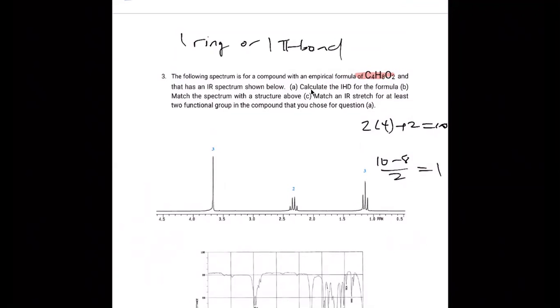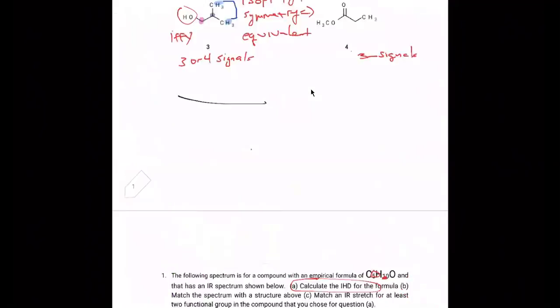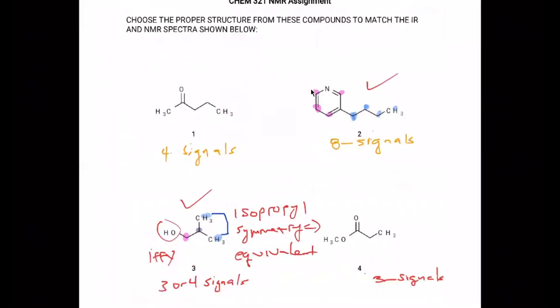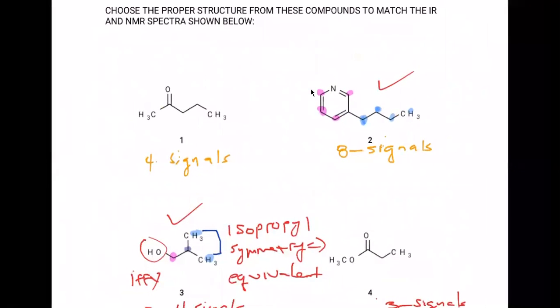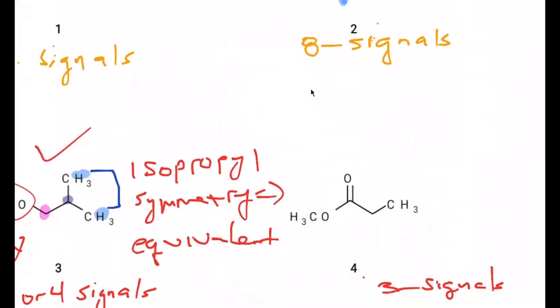So we only really have one other structure that matches that, and that's that ester. Where is it? Right here. Let me cut it.